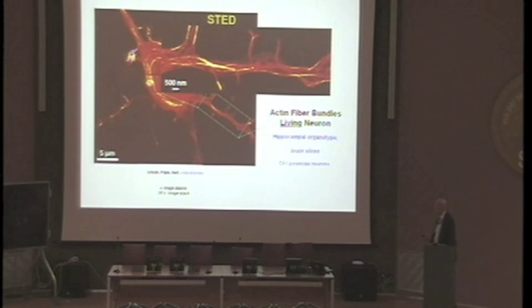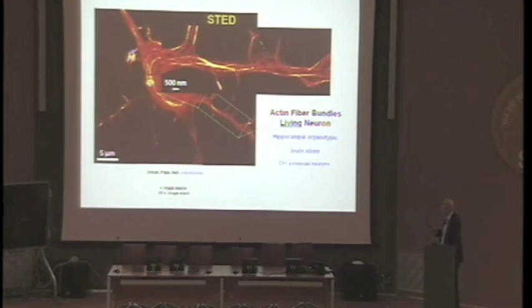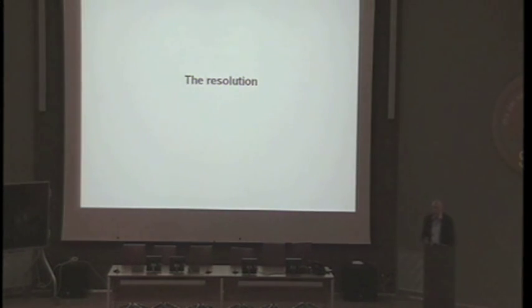Here again, if you do it in hippocampal slices, you have a higher clarity, no doubt. So it's still harder to do it in vivo. If you're just looking at the slices here, you can nicely see the actin structure again in the living hippocampal slice. Okay, so with that, I'm coming back to the basics.